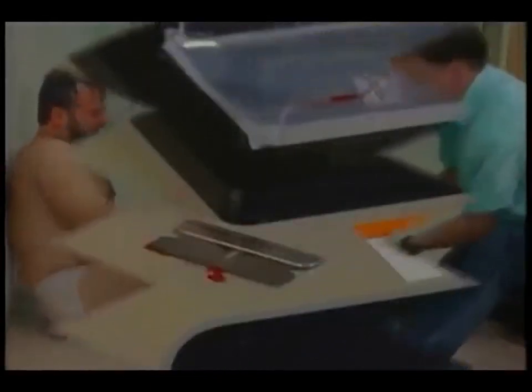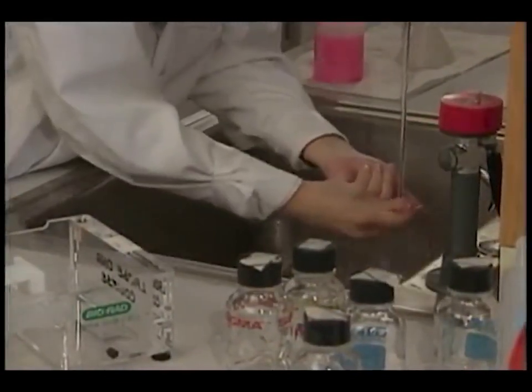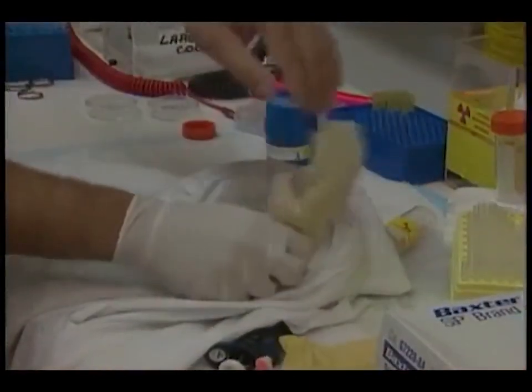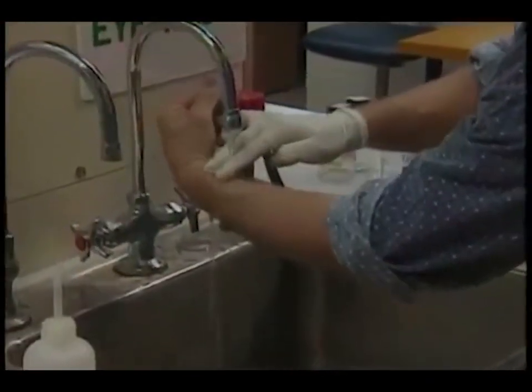The most important treatment for chemical spills is immediate and extensive rinsing. Contaminated clothing should be removed promptly. Minor cuts and puncture wounds should be washed vigorously for several minutes. In fact, any exposure or potential exposure to foreign agents should be treated with generous rinsing. In case of a radiological spill, wash carefully to avoid spreading to other parts of your body.